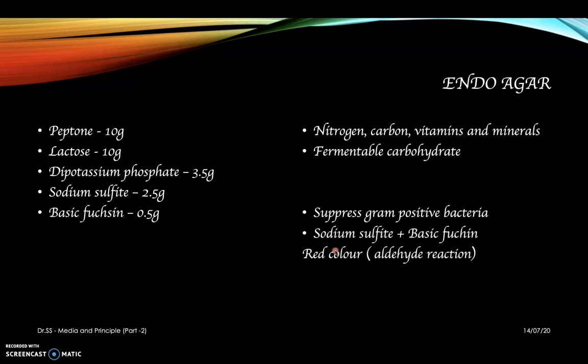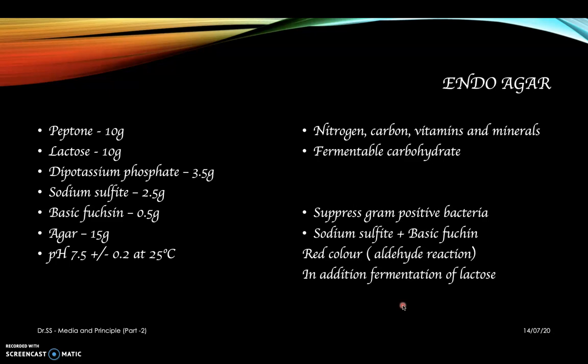And sodium sulfite and basic fuchsin combine to form the aldehyde reaction, which leads to the formation of the red coloration. In addition, the fermentation of the lactose leads to the formation of some pink color appearance on this media. If the organisms cannot ferment the lactose, it won't produce any colors. And agar 15 gram and pH is 7.5 plus or minus 0.2 at 25 degrees Celsius.